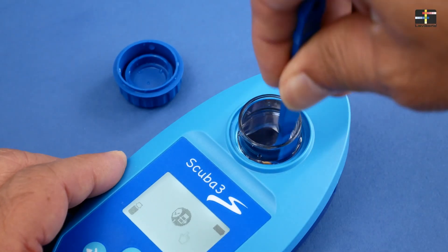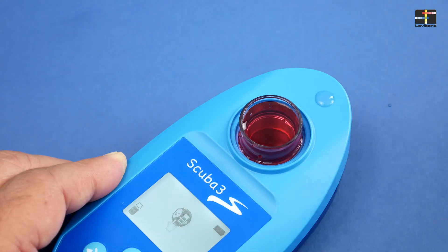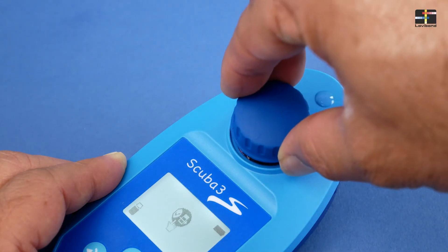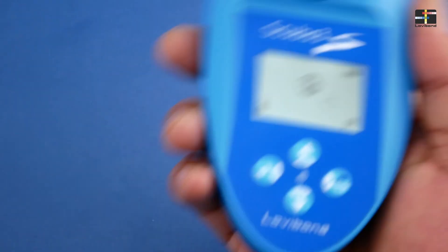Crush the tablet with the stirring rod and stir until the tablet is dissolved. Close the measuring chamber again with the cap and swirl the device back and forth for approximately 15 seconds. Do not shake it.